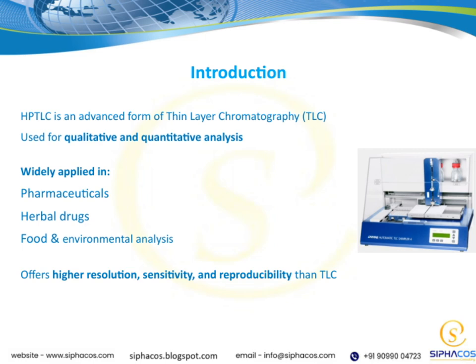HPTLC has a wide range of applications. You'll find it commonly used in the pharmaceutical industry to analyze drug components, in herbal medicine to verify the authenticity and quality of herbal drugs, and also in food and environmental testing to monitor contaminants or nutrients.